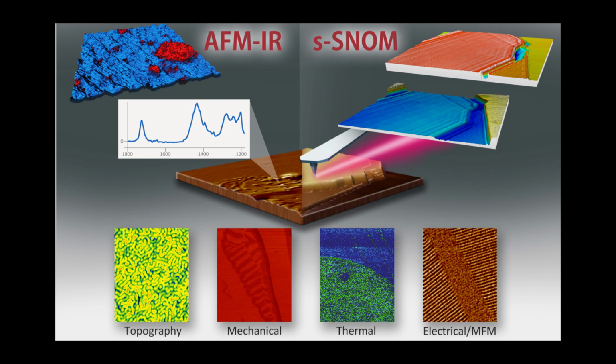And if you're looking at a bulk polymer sample, we look at lots of polymer samples which are just deposited as thin film, or they're spun down onto a surface or drop cast. But if you have a bulk sample, then again, that would best be prepared using a microtome or a cryomicrotome, depending upon the transition temperature of the sample.